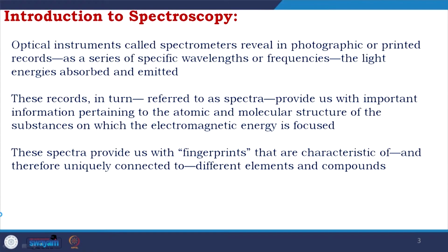These spectra provide us with fingerprints, as I was talking about, that are characteristic of, and therefore, it is a unique connection to the different elements and compounds.